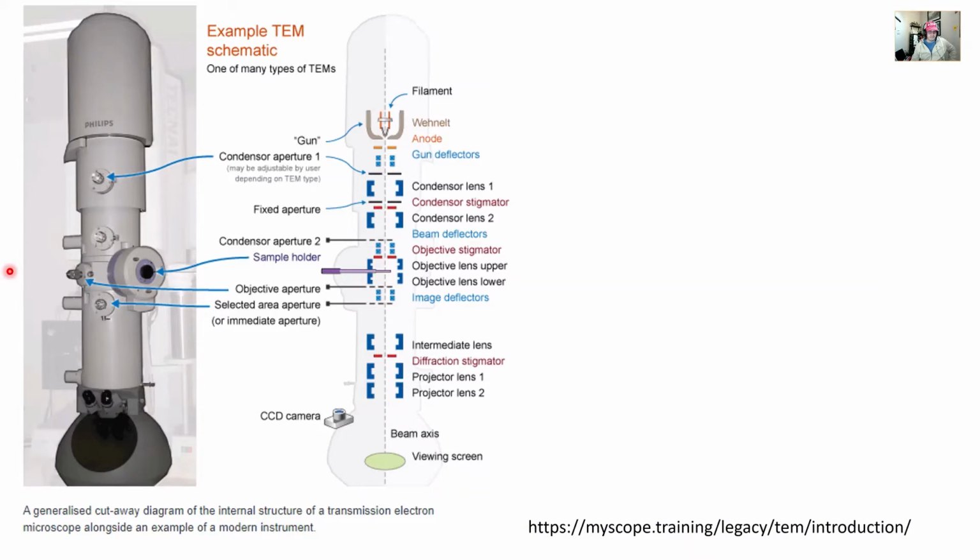Just reminding you all what the TEM looks like, it's basically just a big projector. A TEM specimen can almost be thought of as a slide, like for a slide projector, and the specimen goes in here in this little purple thing for the sample holder. The beam shines through it and then projects down onto a phosphorescent screen. Some systems go straight to a digital imaging system. The one we have in metallurgy goes to the phosphorescent screen. When you want to take a digital image, the phosphorescent screen moves up and then it hits a CCD. So it's pretty much a projector.